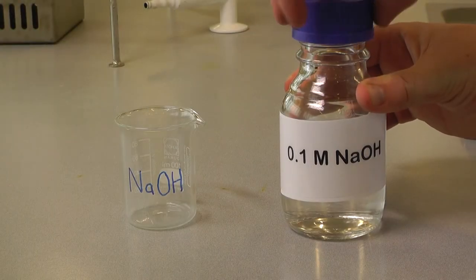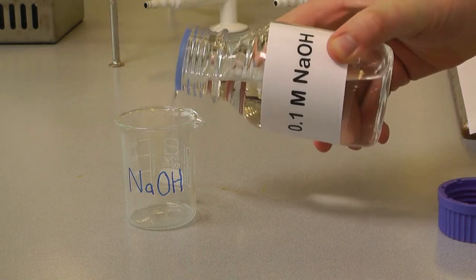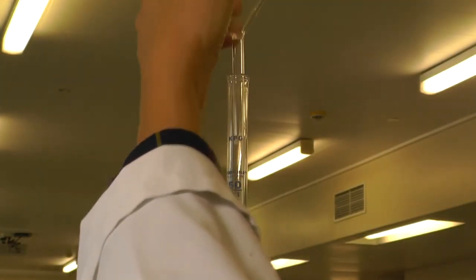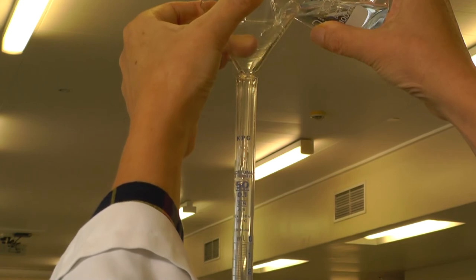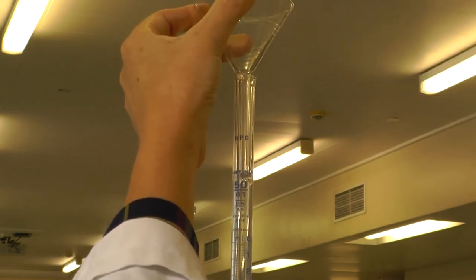Pour some stock solution into a labeled beaker. Put a funnel in the top of the burette, wiggling it around to ensure the stock solution contacts the inside of the burette. Repeat this a few times with a small amount of the stock solution before filling the burette.